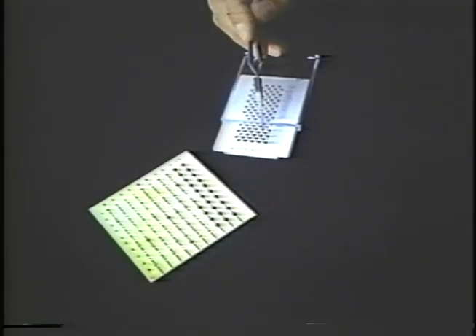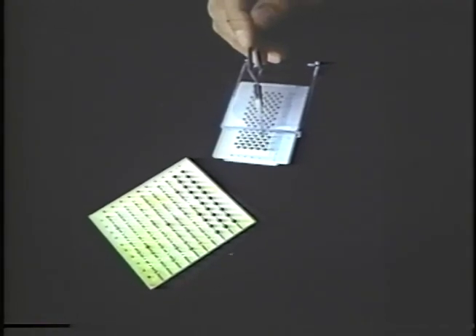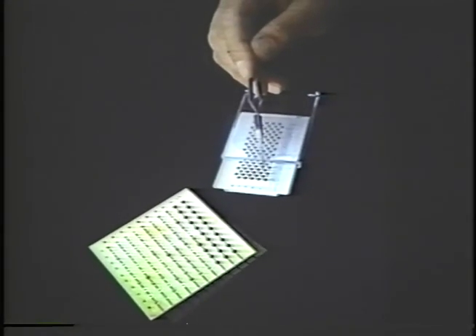After the grids are stained, we evaporate a light coating of carbon onto the grids to stabilize them in the electron beam, and we made a little grid holder for holding 100 grids.